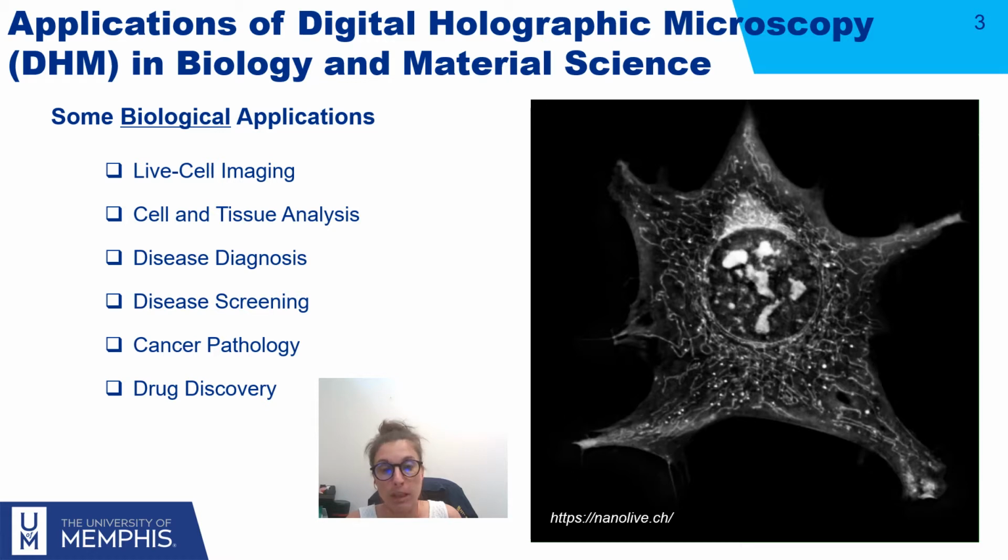It's completely quantitative, so we can analyze cells and tissues. Because of the quantification, we can diagnose and screen diseases, and understand the pathology of cancer cells.